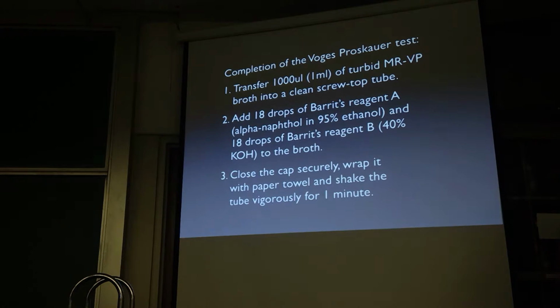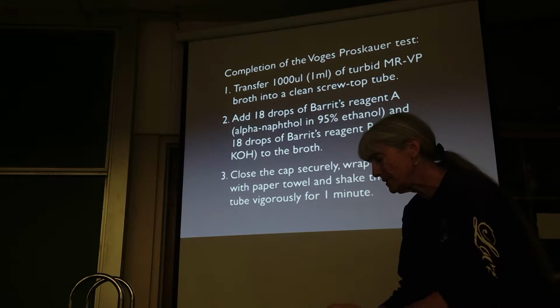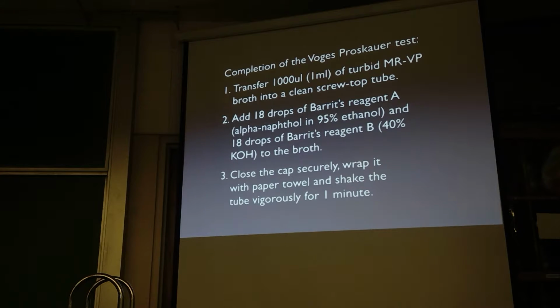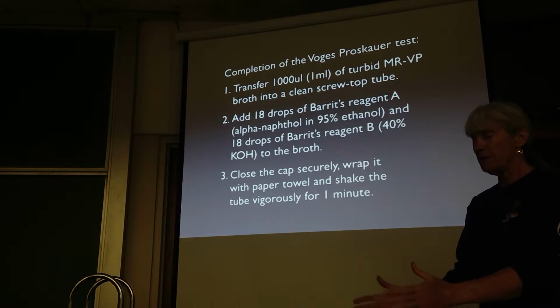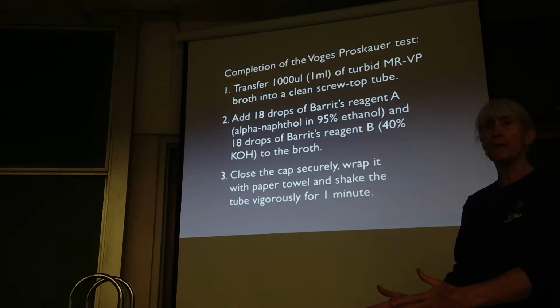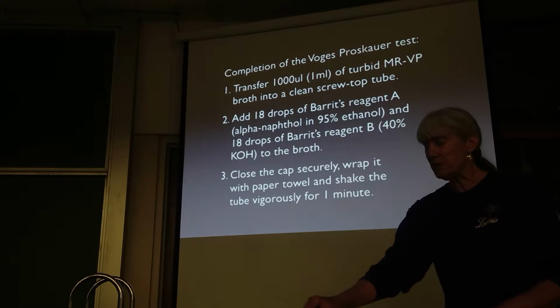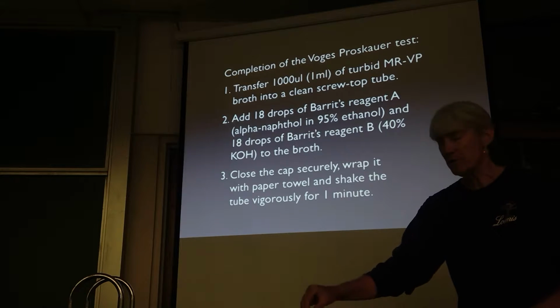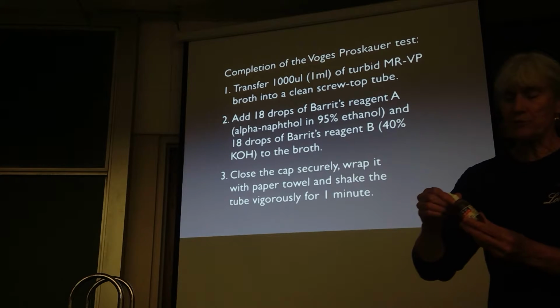These reagents are here, so I'll put them up here with the pipettes. And then usually what we do is set up a little piece of particle board with aluminum foil on it, so that these reagents can stay on the foil. This is because we're using a couple of things here that are somewhat nasty.